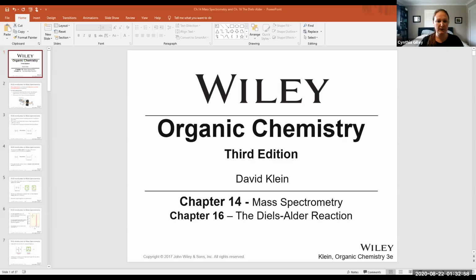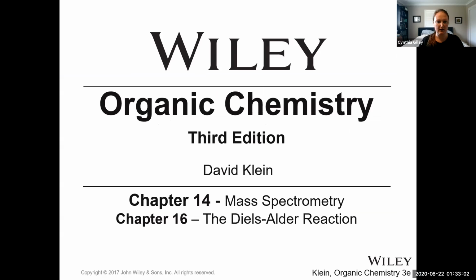All right, we're going to go through these PowerPoint slides, and as I talked about before, we are going to be talking about mass spectrometry and then talk a little bit about the Diels-Alder reaction, which should correspond to your lecture this week as well.